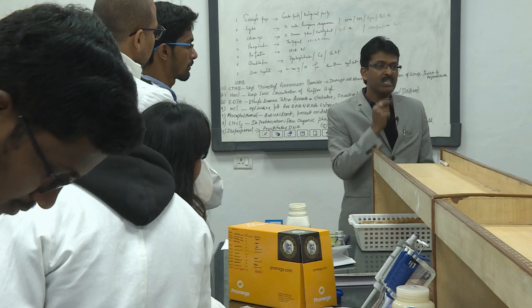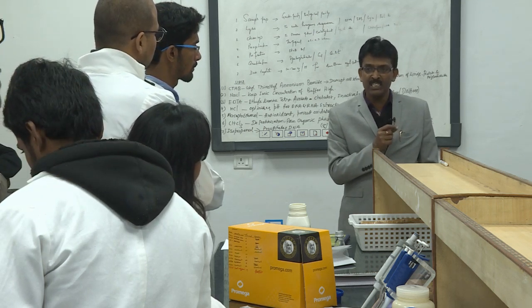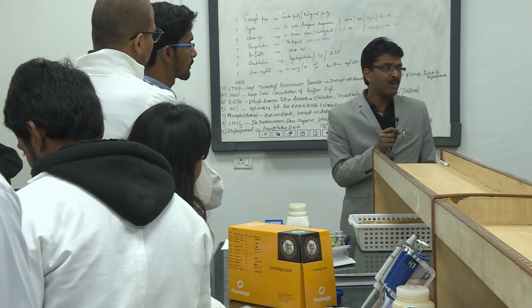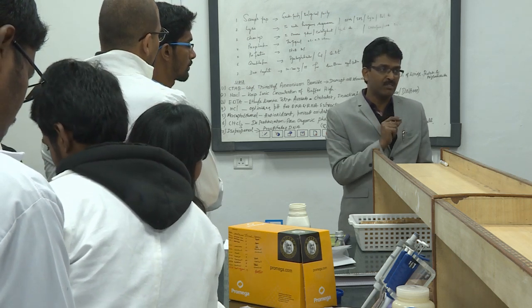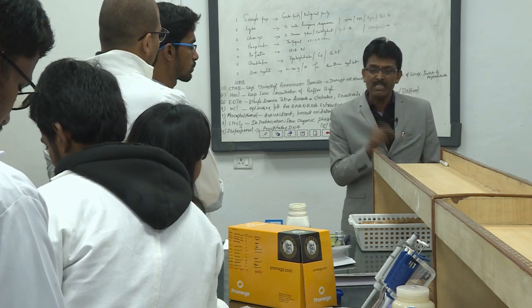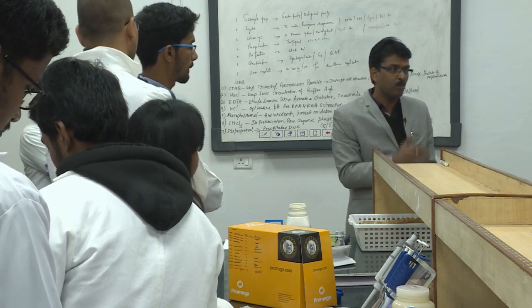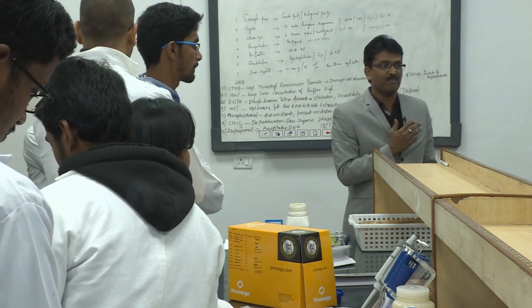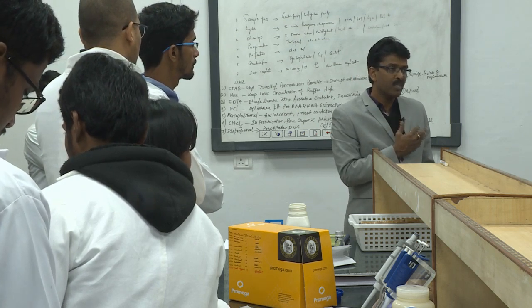And if you have low quantity, and there are some protocols which cannot tolerate EDTA, we discourage EDTA in those protocols. We go for EDTA-minus buffer or low-EDTA buffers. That is what I prescribe. TE 10:0.1, 10 times less EDTA. That is another option, right? The third option is you can go for only Tris, right? And some people even prefer to go for water.